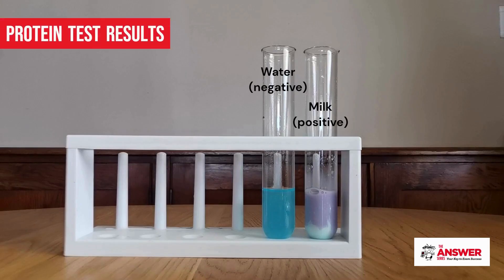A blue color indicates a negative test for protein, whilst violet or purple indicates a positive test for protein.